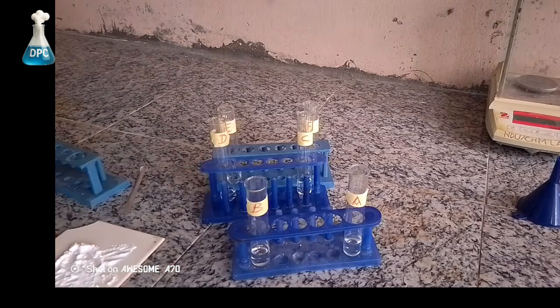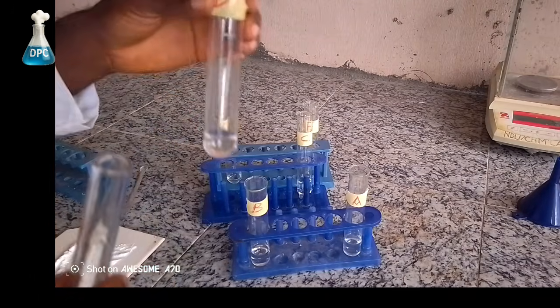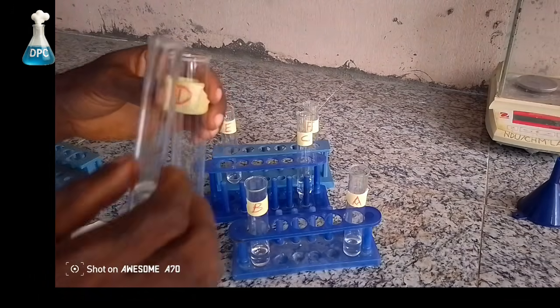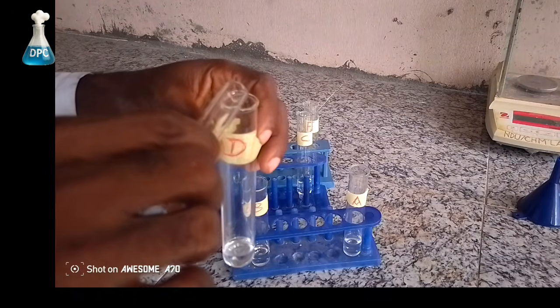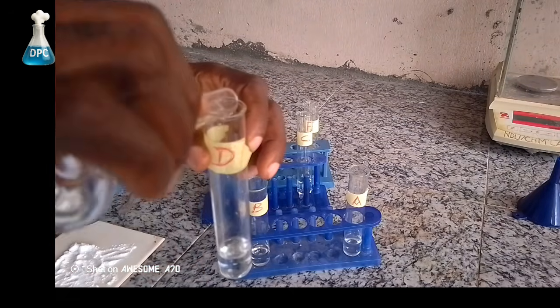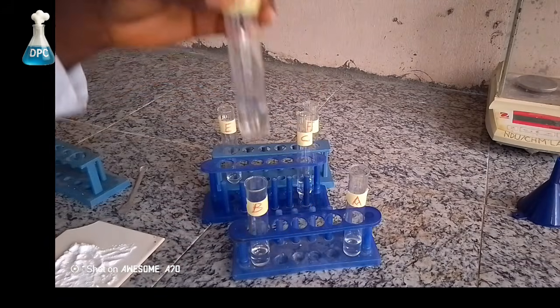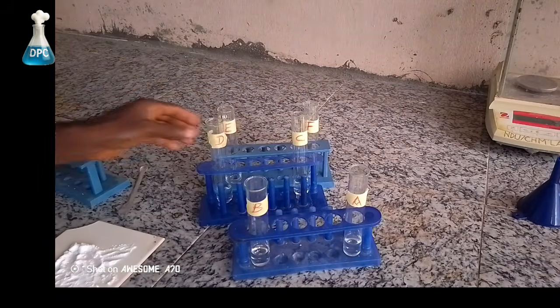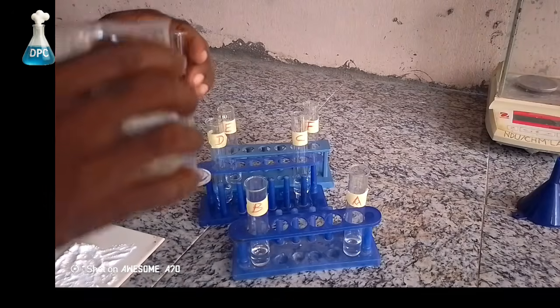The same thing for test tube E, which is 3 ml of the acid. We'll now add 7 ml of the water to make it 10 ml. Then test tube F, that has just 1 ml of the acid, will add 9 ml of water to make it 10 ml solution.